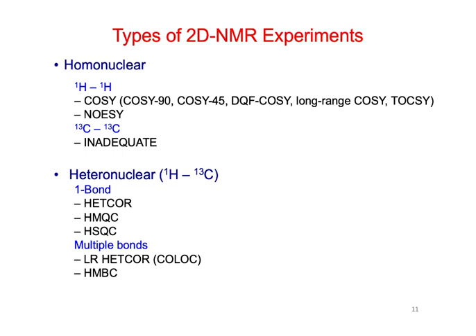And they have to look at all the cross peaks and line everything up. And now, because we have two-dimensional NMR, they can do three-dimensional NMR, where you have three different axes, like a big cube. All right. We're not going to go there.